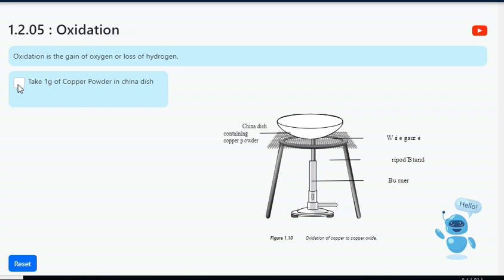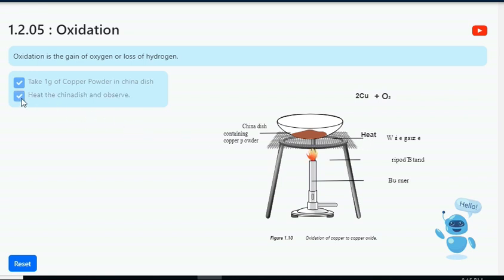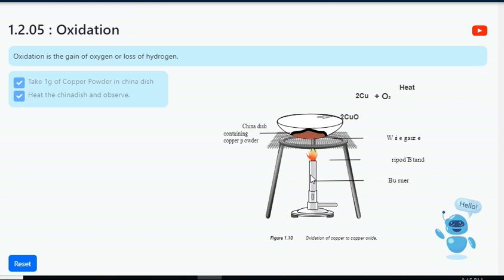Select the first checkbox to take 1 gram of copper powder in a china dish. Select the second checkbox to heat the china dish.